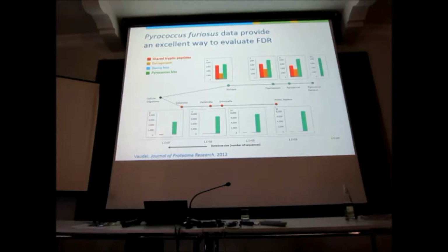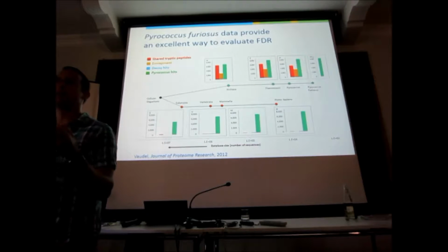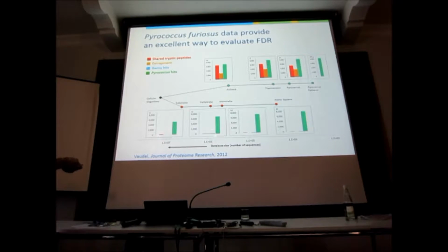Look at the green bar. From that side to that side, what does the green bar do? It goes down. You see that? The number of hits you get back goes from 8,000, 7,000, 6,200, and here, when the database really gets very big, it goes down to 5,000. Is this good? Do we like this? No. Okay? This is the biggest problem when you search a large database. The recall, the number of peptides you identify, goes down dramatically. Okay? However, we do still control the FDR.